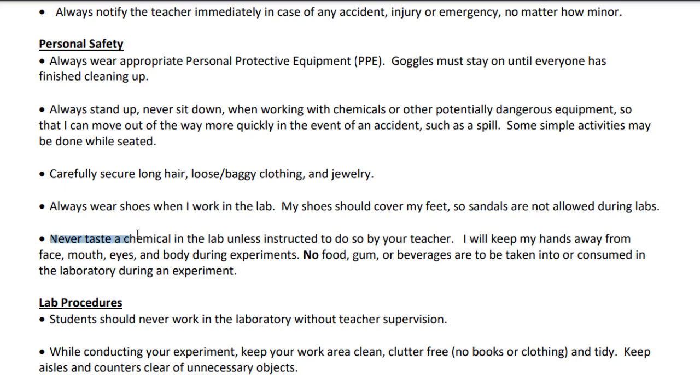Don't eat anything in here unless I tell you to. If I'm telling you to, I'm not trying to trick you. It'll be safe to do so, but don't just taste stuff in here unless I'm actually asking you to. And you want to make sure we're not eating in here, with the exception that we've got these weird COVID rules where you do have to eat in here during lunch. So we're just going to make sure that all the chemicals are squared away when it is lunchtime.